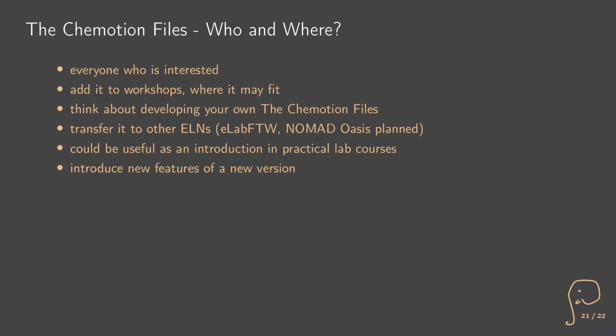Also, what I like to do in my PhD thesis or with my colleagues, we always had some riddles on whiteboards or something like this, right? So you can also do this with Chemotion files and just get familiar with the ELN, which brings me to the point that Chemotion and all other ELNs are developing quite fast, and you get new features and so on. And most scientists, most people in the lab will not read the whole update, what is new, which functionality is new, right?